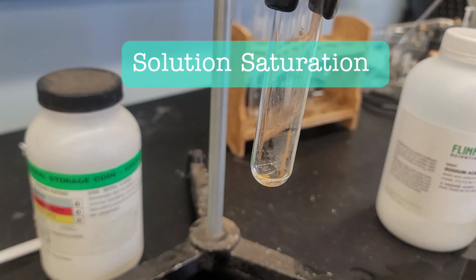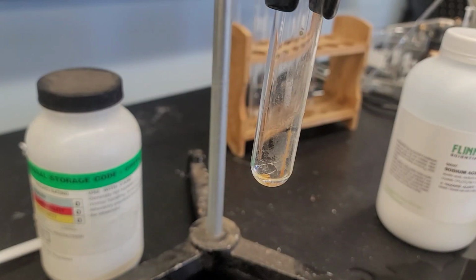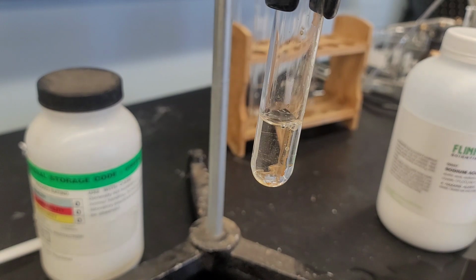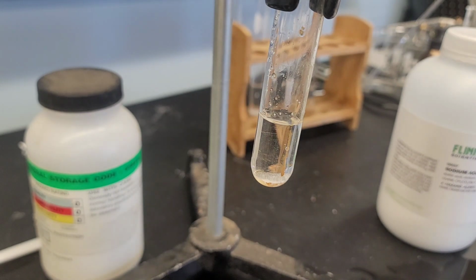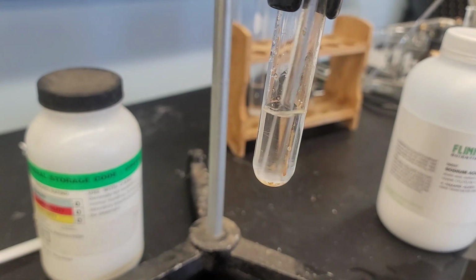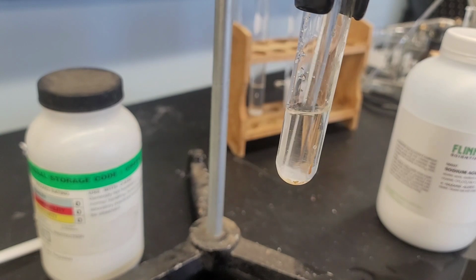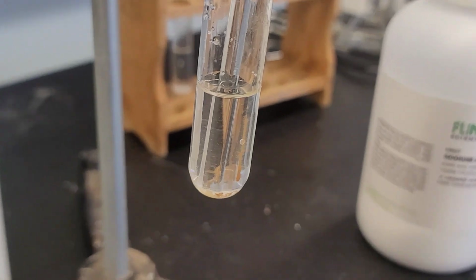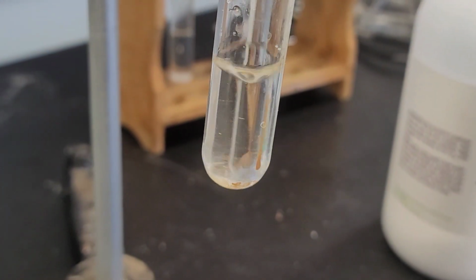All right, so first experiment is going to be observing an unsaturated solution. So the word saturated is very similar to the word satisfied or satiated, meaning full. So if I have some water and add some table salt, which is the solute, so water is the solvent, table salt is the solute, and I stir it. Let's see if we can get that clearly there.